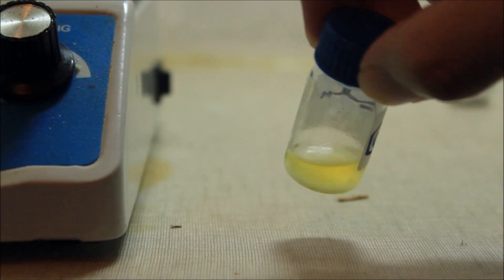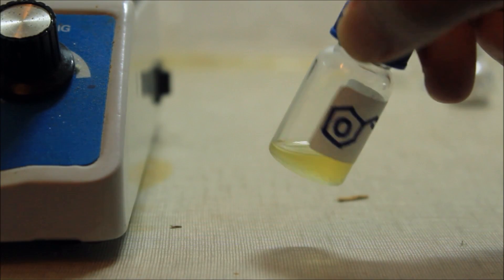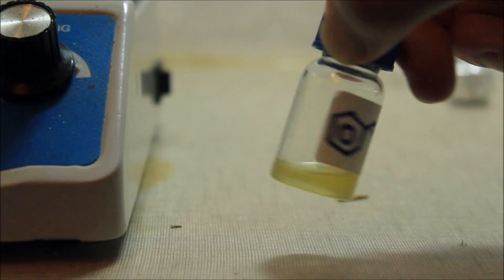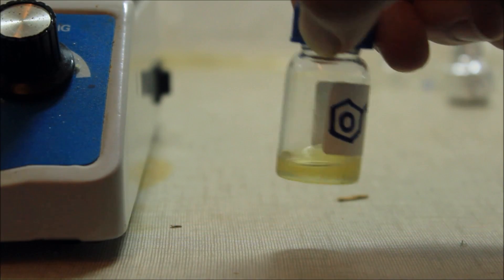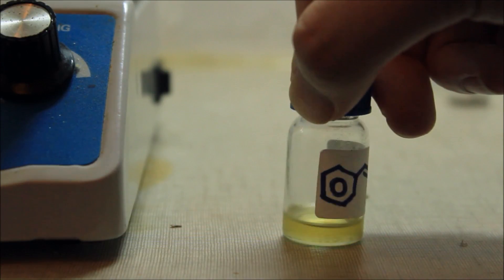This is mainly cinnamaldehyde but it also contains some other major components as eugenol. The final yield was 0.50 g of crude and dried cinnamaldehyde, which is close to the expected yield.